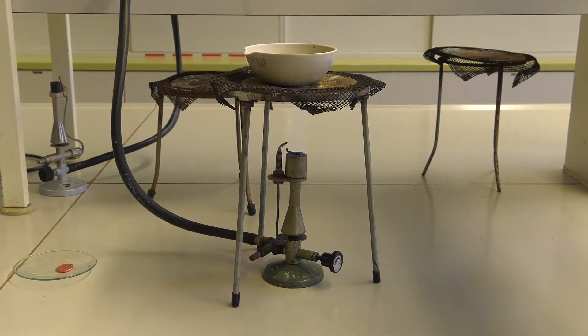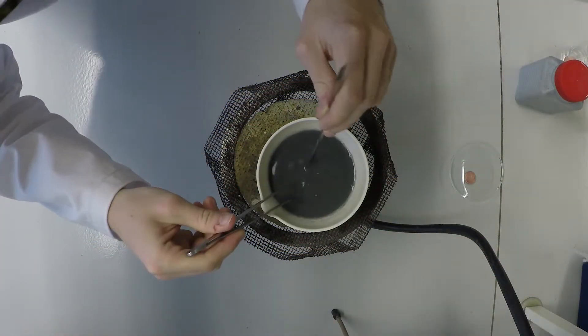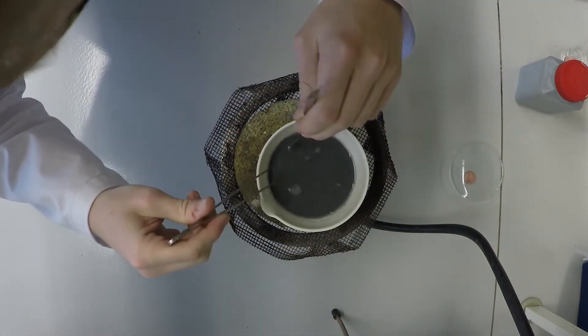Lift the bowl with the tongs off the wire net. Then, lift the coin out of the suspension using the tongs and rinse the coin under running water.